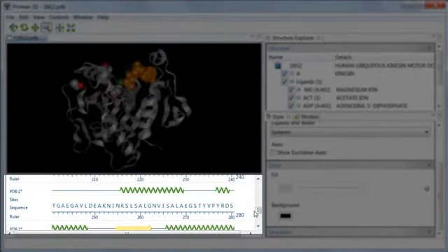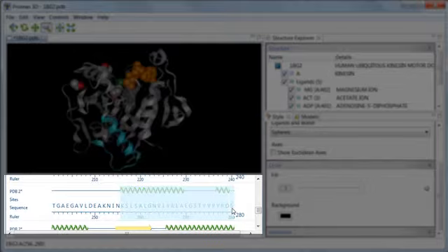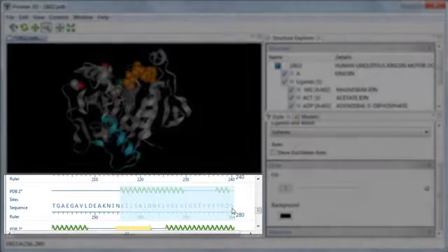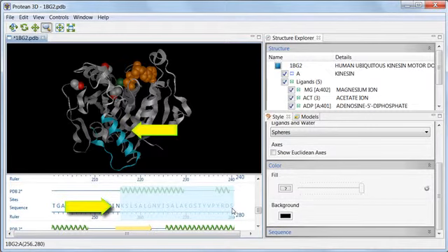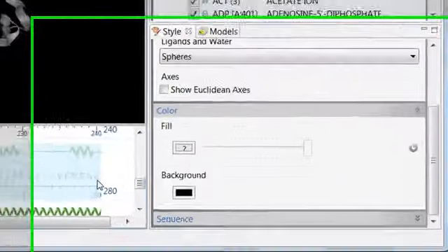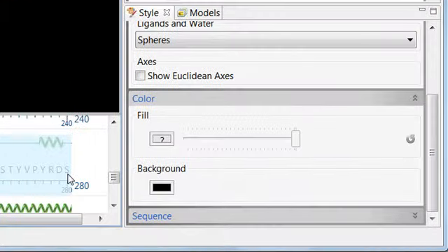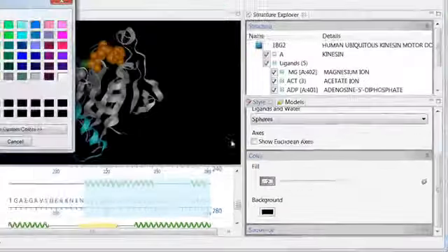So I'll use my mouse to highlight this range. You can see that it is now highlighted in blue here in the Sequence view, and also in the Structure view. Again, I'll go to the color bar, but this time I'll change the fill color to a medium blue.